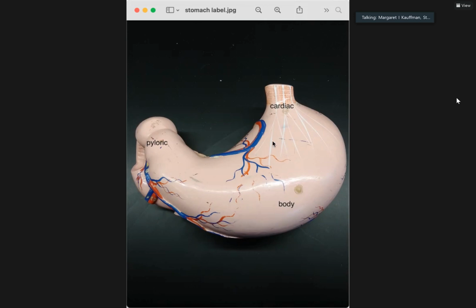So that defines kind of the cardiac region of the stomach where you secrete alkaline mucus. Primarily, the pits are there, but they're pretty shallow. They don't go way down. And pretty much all that's secreted is alkaline mucus. And then the body, that you're drawing in the slides with all the cells, the chief cells, parietal cells, the gastric glands, all that stuff.